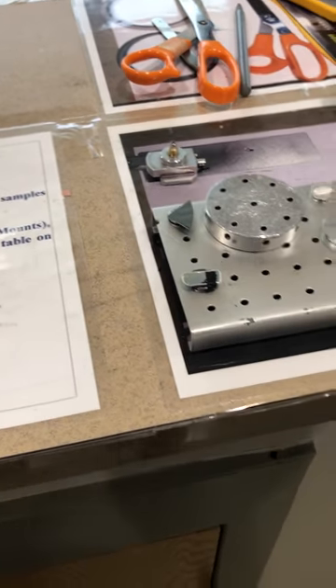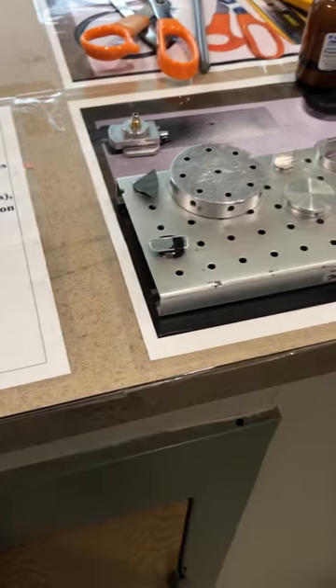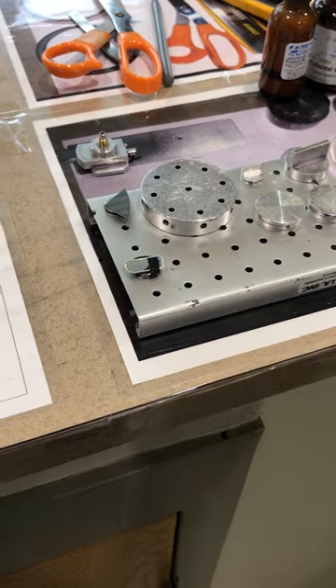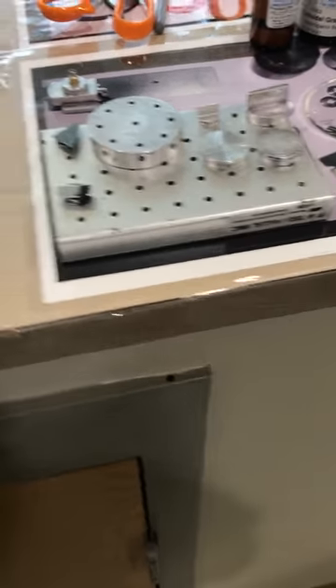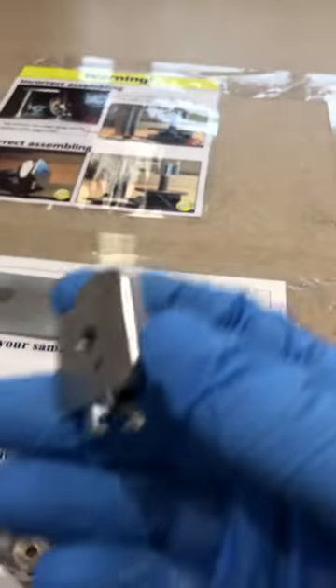After you do that and make sure your sample is ready, I encourage you to watch the slides for sample preparation to make sure you are preparing your sample correctly. 20% of the analysis is based on preparing the right and accurate sample.